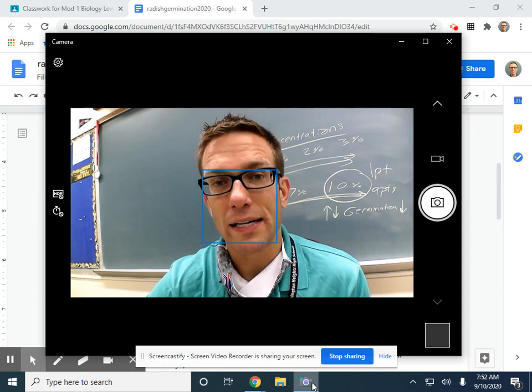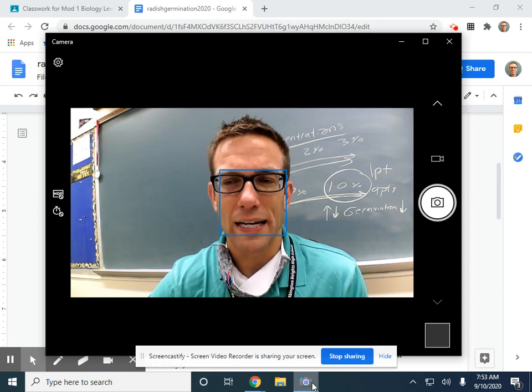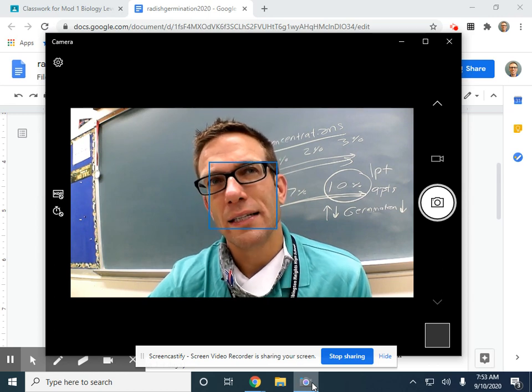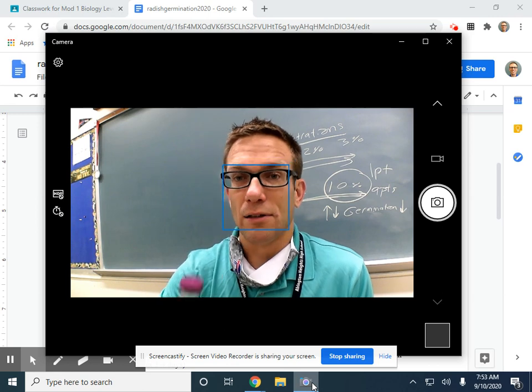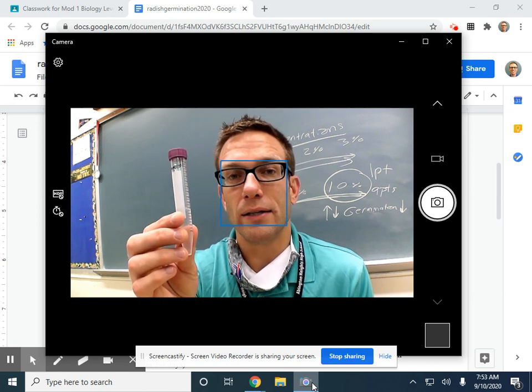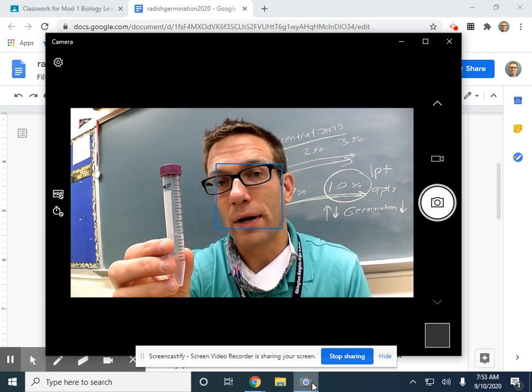And every day, you might not need to check it every day, but today's Friday, I would say definitely Sunday, take a look at it. If it's looking dried out, add a little bit of water to your paper towel. Remember, you want it damp or moist, but you don't want it dripping.